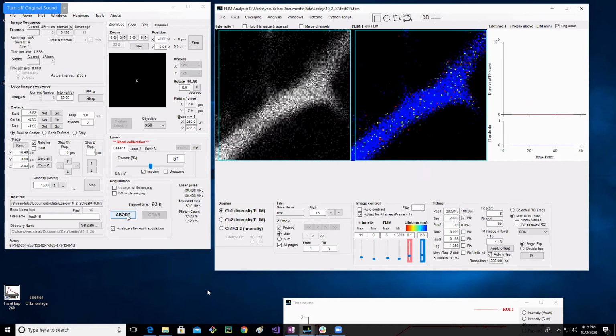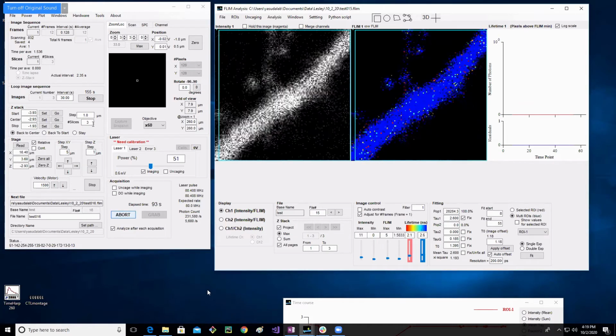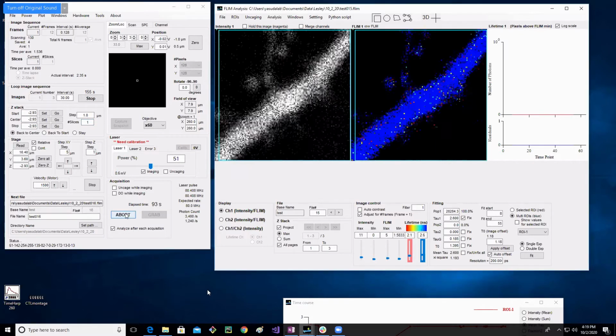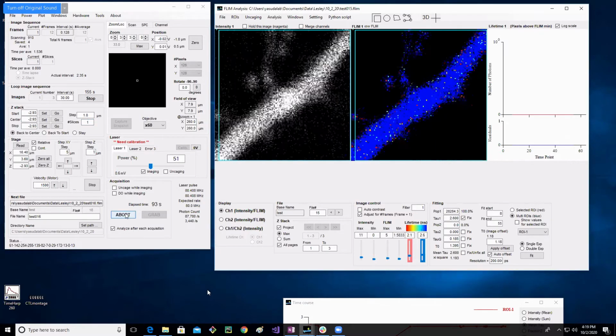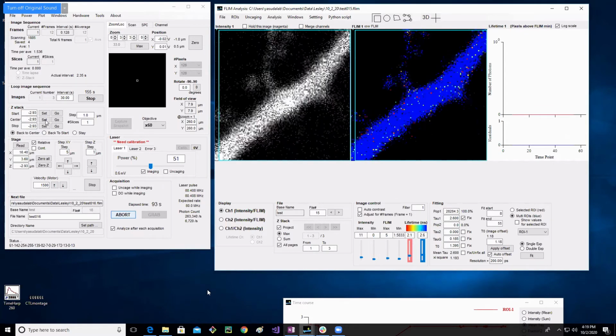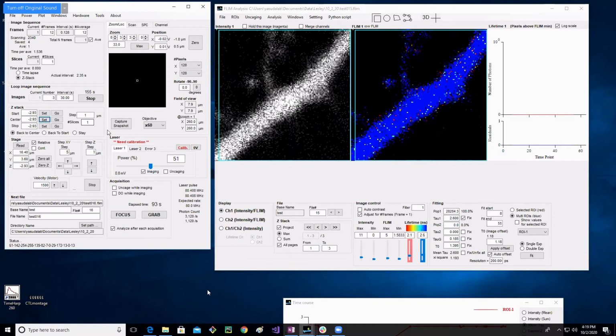In the software, if you have a set of 1 slice, like if you're not intending to take a Z-stack, in the software version, I think it's been fixed now, if you don't hit set, it will move it, like it thinks it's taking a Z-stack. But generally, no, you don't have to. It will just read wherever the focus position is. That will be the center. But if you want to be extra sure, you can always hit the center button. Okay.